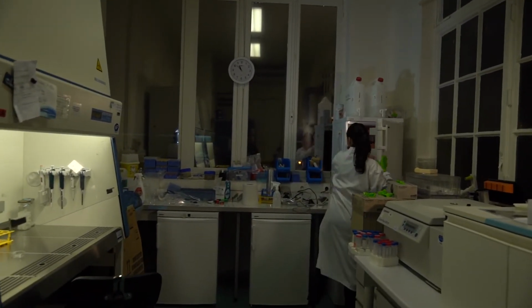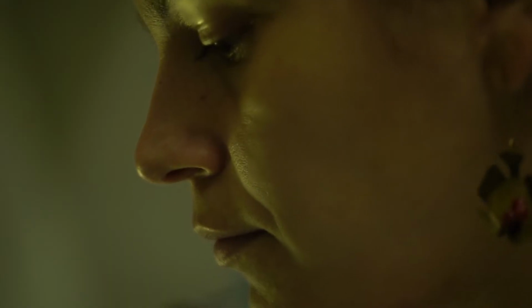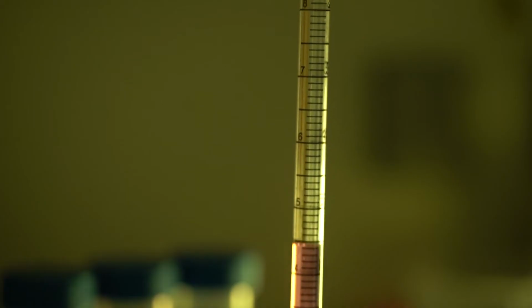In the lab, we work with numerous distinct cell types. We chose cells from the retina, from bones or blood, which were first put in culture in flask, then aspirated and plated on the mini buildings.